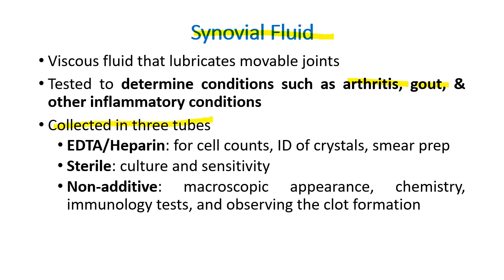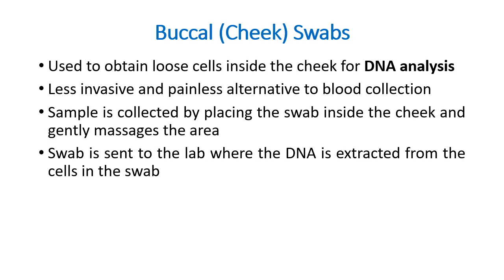So it is collected in 3 tubes. We have EDTA heparin for cell counts, identification of crystals, and smear preparation. Sterile naman for culture and sensitivity, and non-additive for macroscopic appearance, chemistry, immunology tests, and observing the clot formation. Buccal or cheek swab, para saan yan? Mahalaga lang dyan is for DNA analysis.